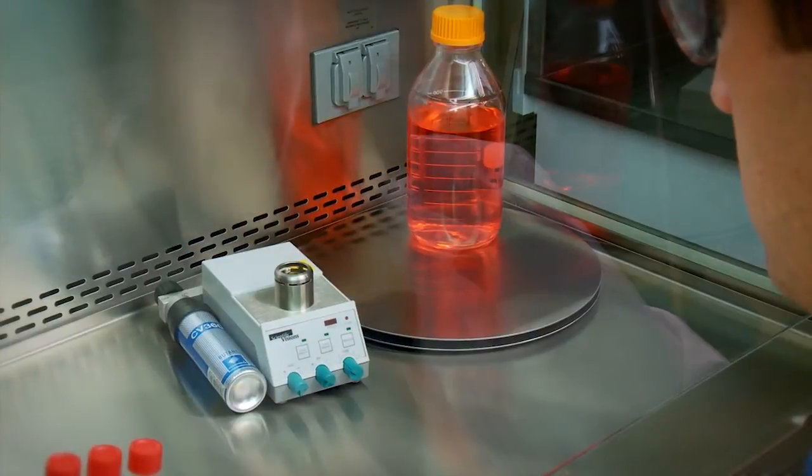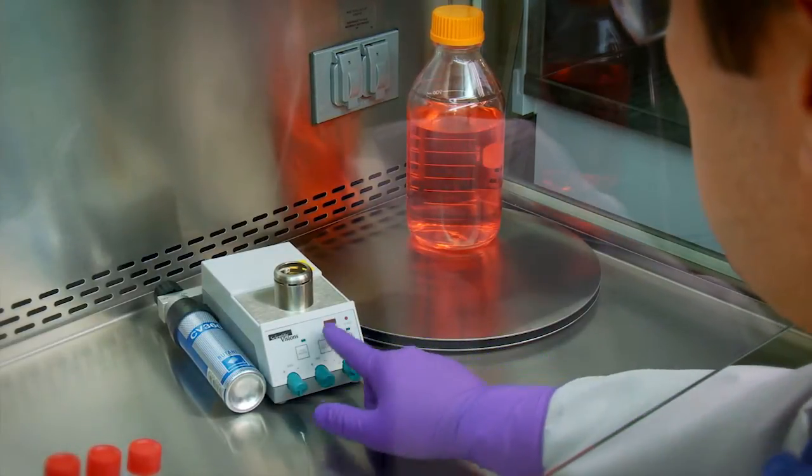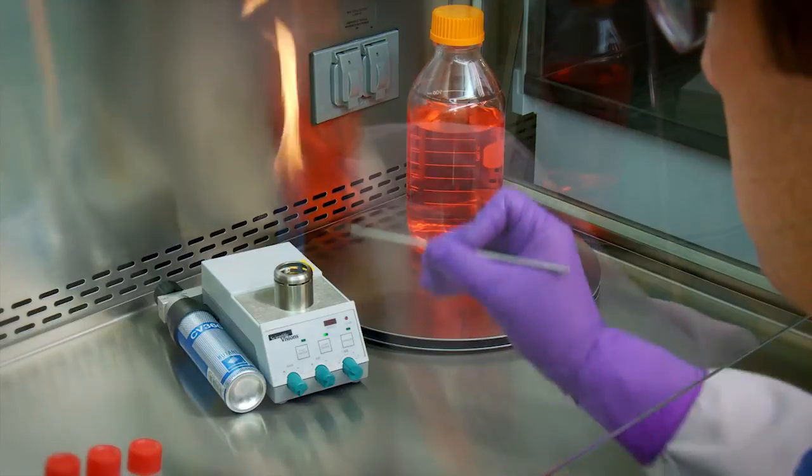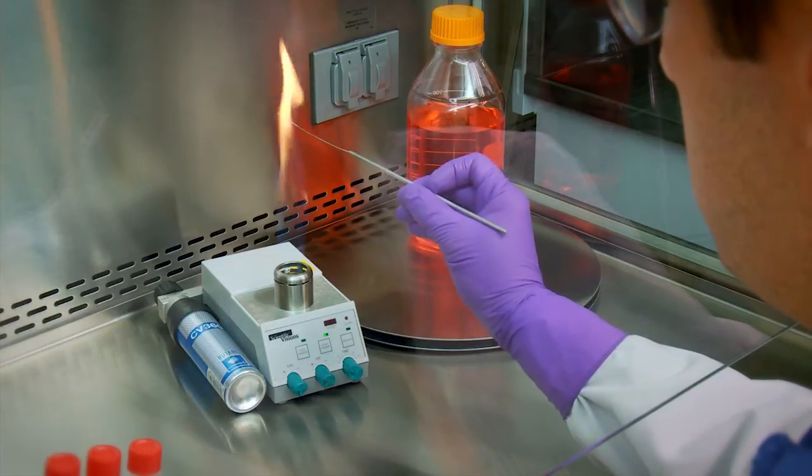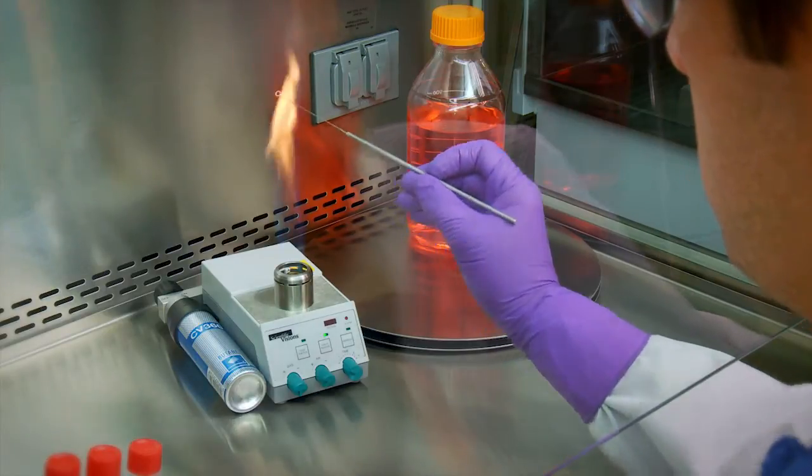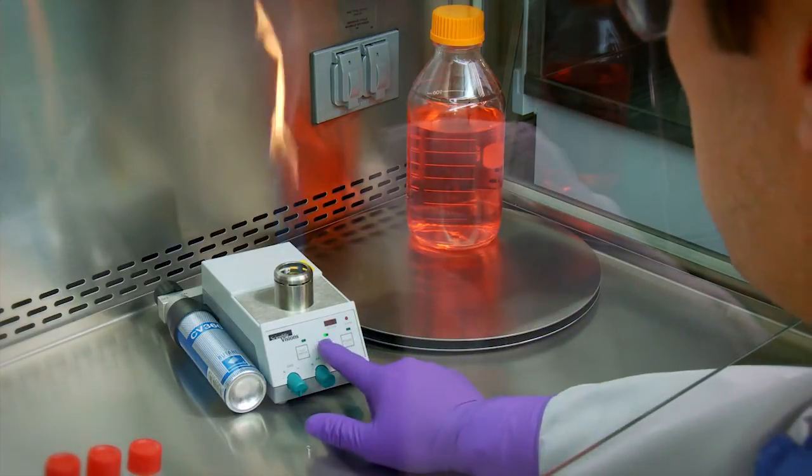Most procedures should not require use of a flame when combined with good aseptic technique and proper cabinet use. If a burner is required, use the on-demand type with an electronic ignition. Since a burner will produce air turbulence, place it to the rear of the workspace.